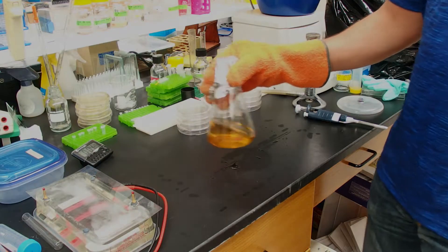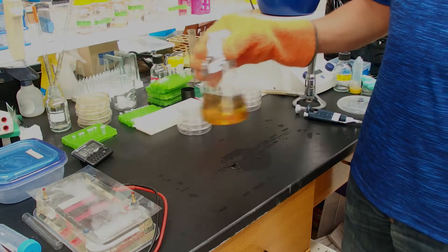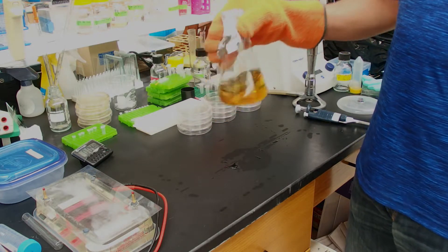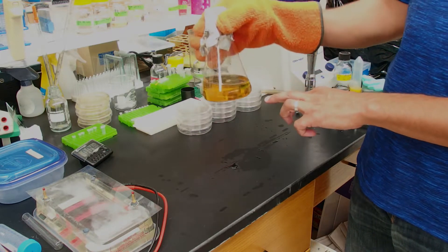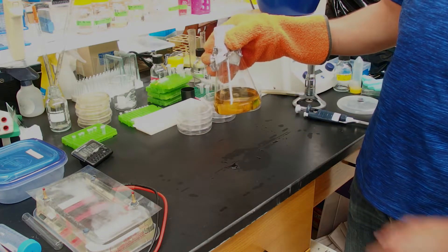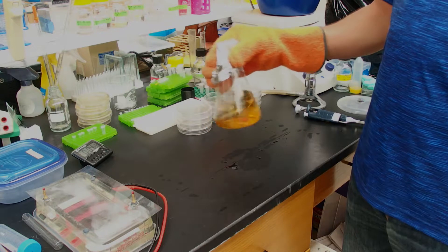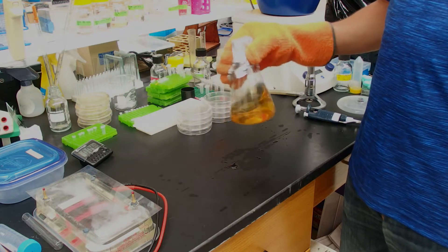After autoclaving, give your flask a good swirl like this. While it all looks homogeneous, there's often going to be a layer of agar on the bottom. And we want to get the agar mixed very well with the rest of the media.